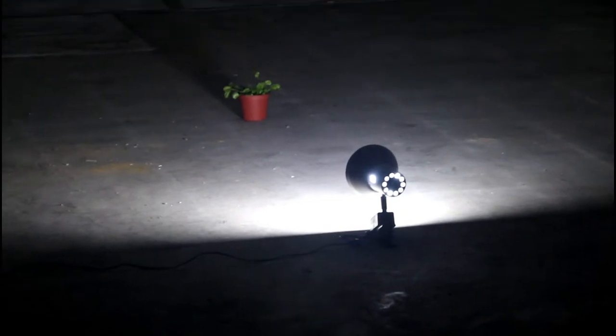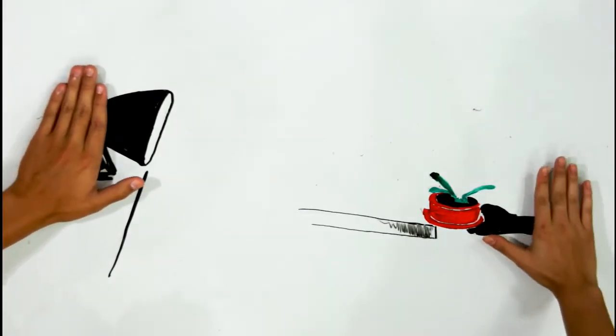We did this in 3 separate areas of the dark room. Later on, after 24 hours, we changed the distance of 2 of the lamps compared to the Flytraps to 150 and 200.